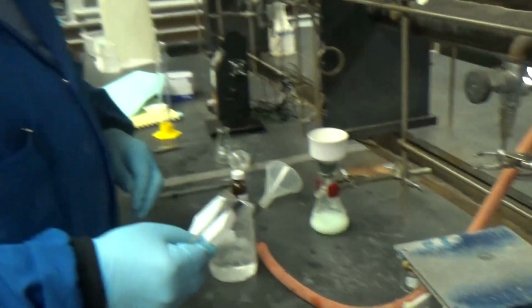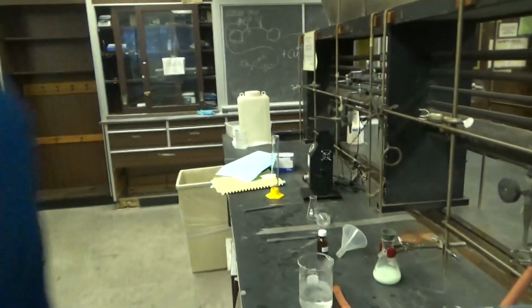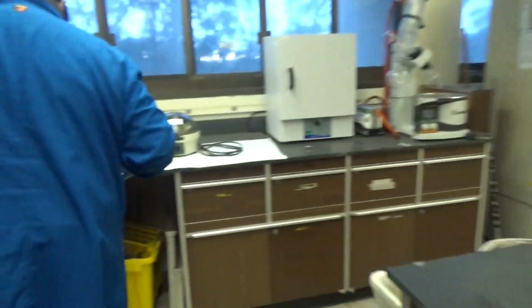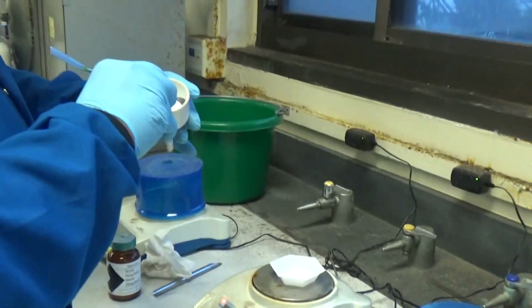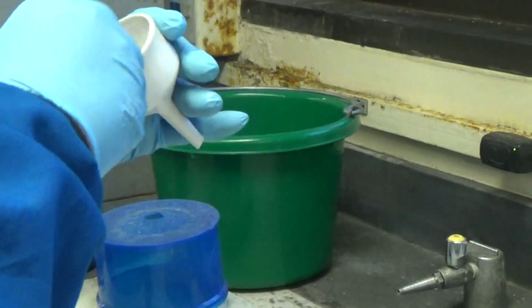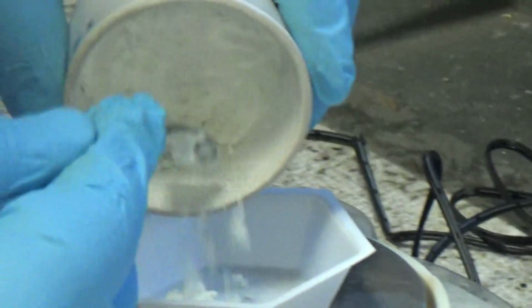Okay. So we bring that to the balance. You can get a crude mass. It looks like a nice material.